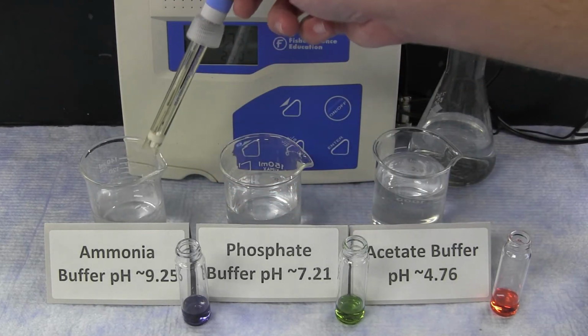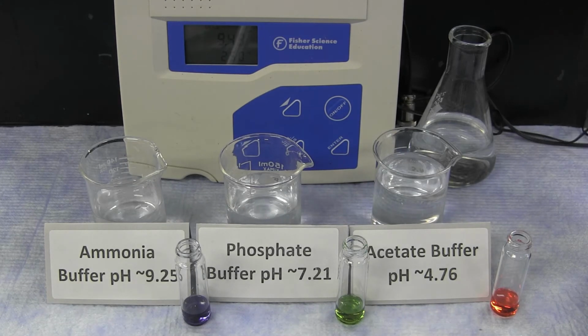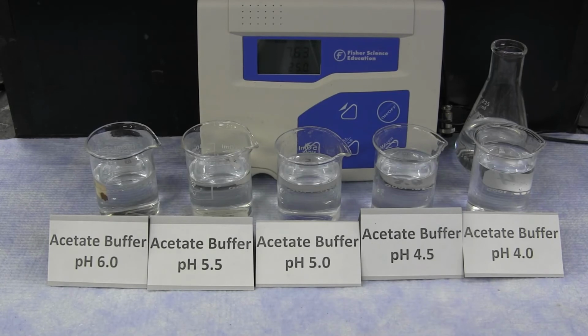All of these buffer solutions are prepared using conjugate acid-base pairs, and the different pairings based on the equilibrium constants generate buffers that are hovering around a specific pH. While the general pH of a buffer is determined by the acid dissociation constant and the equilibrium constant, the specific pH of each solution is determined by the concentrations of the conjugate acid and base pair.